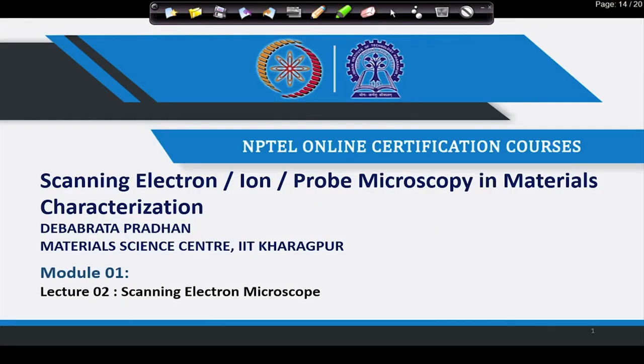Welcome back to the second lecture of this course. In our first lecture, we discussed two important terms, magnification and resolution. Resolution is one of the important criteria to know the performance or power of a microscope. So, we have come to a formula, that is the Abbe formula, which is resolution or d minimum equal to 0.61 lambda divided by numerical aperture.